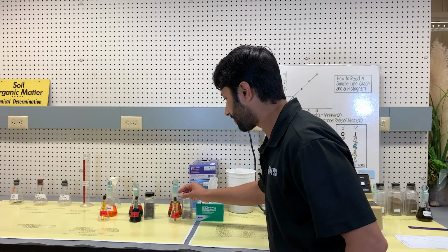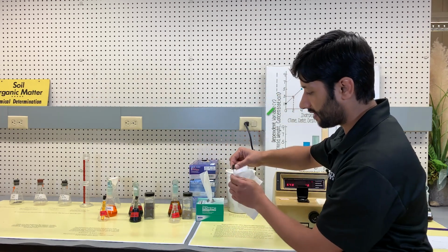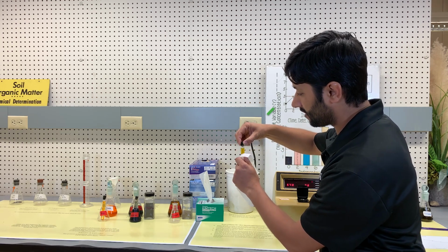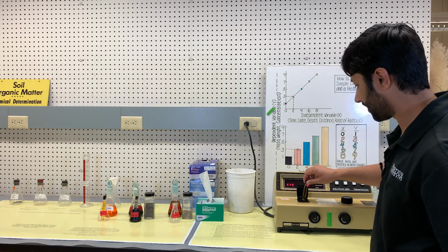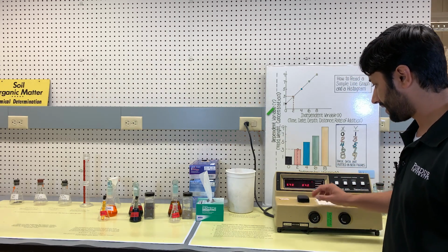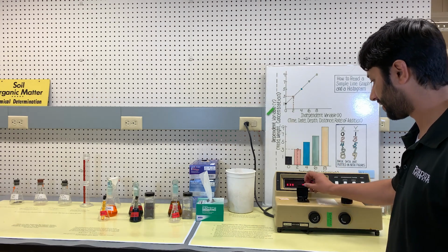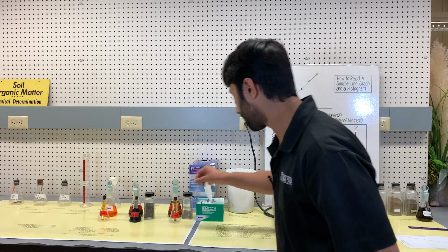Every time you take a sample, you need to hold it from the top so that the oil from your hands does not stick to the cuvette. So you clean it and then you place it here. But I did all of those steps before. And this is the Claremont soil, and it reads around 85 or maybe in that range.